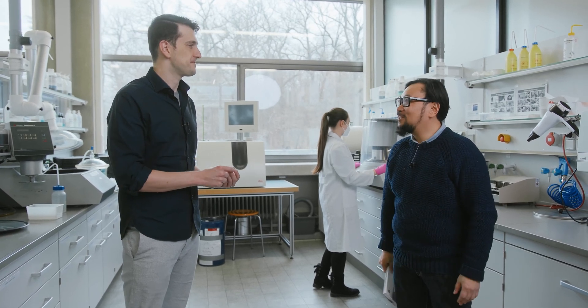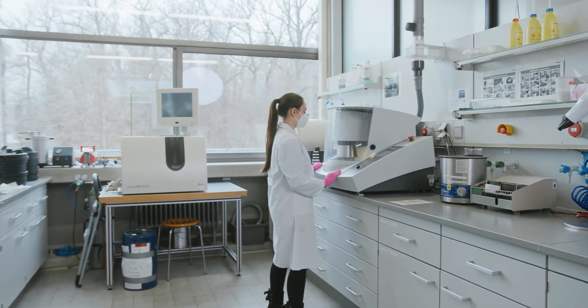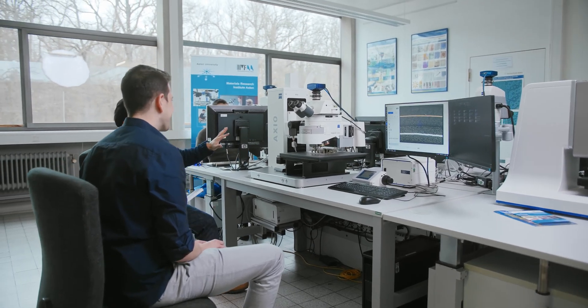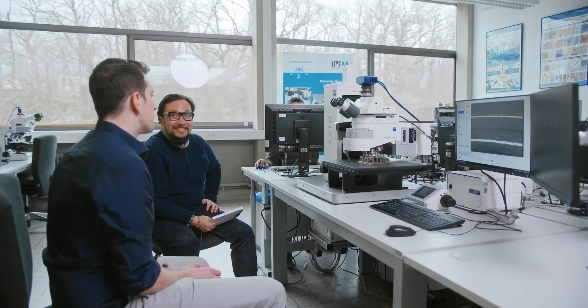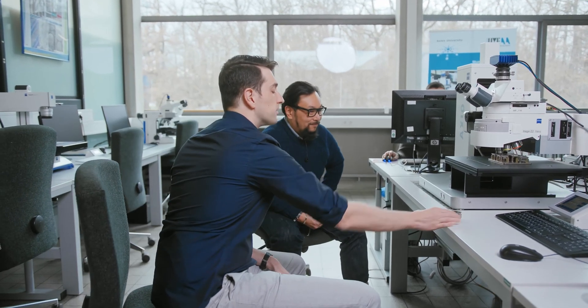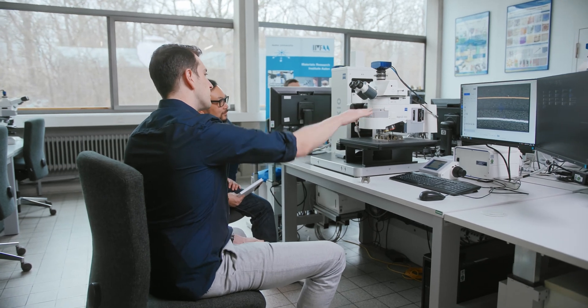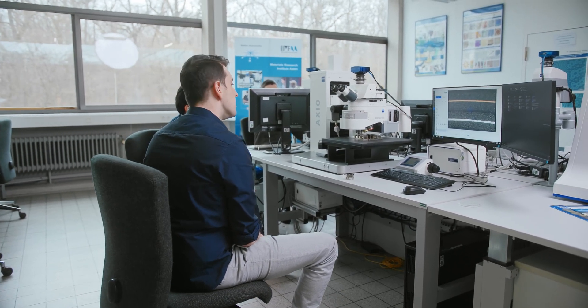After that we can go to the microscope and have a closer look at the microstructure. This looks like a pretty intense setup. It is actually. This is a microscope with a quite big table so that we can look at really great images and great samples. We take our battery sample in the sample holder and go under the microscope for a close look at the microstructure. Here we can see single particles within the electrode coatings, and then we have a closer look for any defects, faults, or particles that shouldn't be there, and try to analyze them.